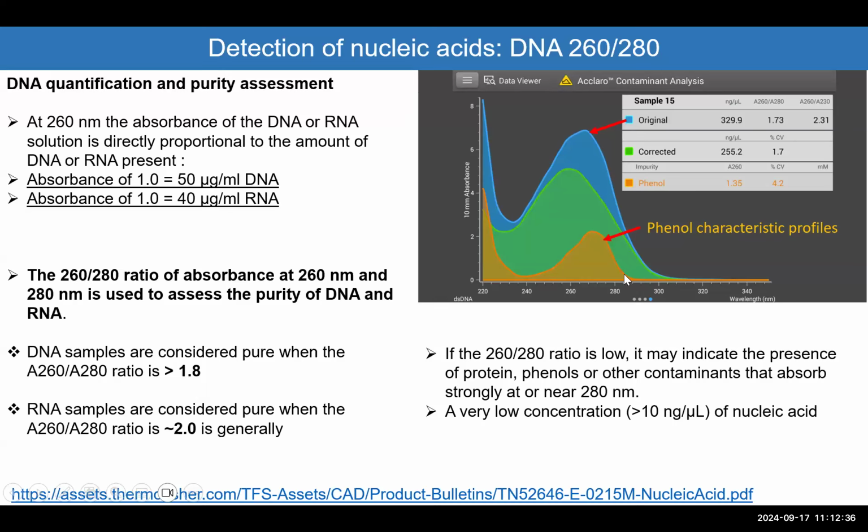Now, if you go back and repeat the steps and purify it, then your DNA is going to look like the green one. The peak will look like 100% at the 260, and the top part of the peak is higher than the start from the y-axis. So 2 things all the time you have to look at.